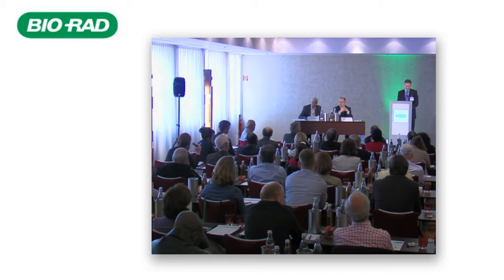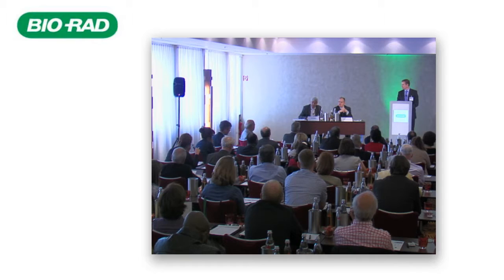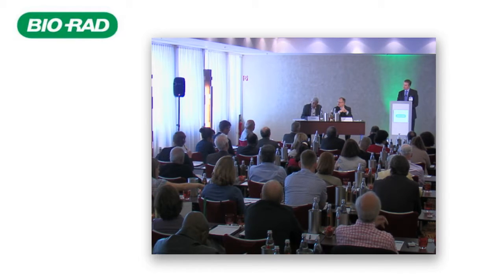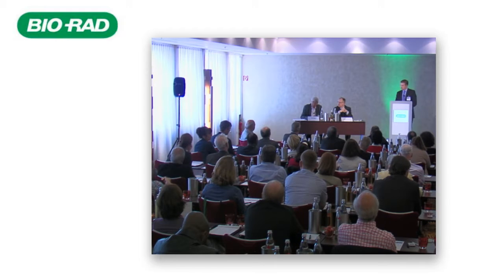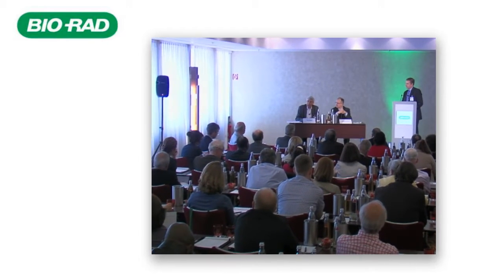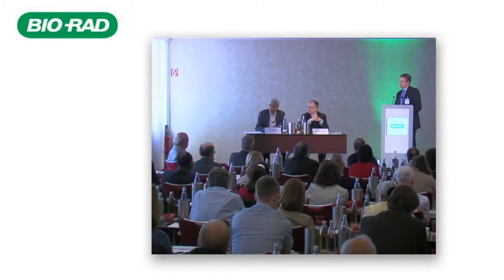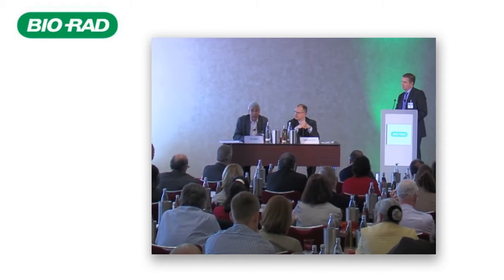It depends on the rules previously done. But generally, we have no closing of laboratory. Our only advice is about what should be done to correct the errors. And then, we have also not yet, let's say, completely defined criteria for that. We are just in the phase of discussing what kind of criteria we can use to evaluate participants and how we can inform them.